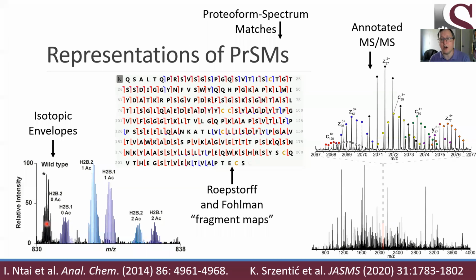Remember that any carbon that you see in a protein is generally carbon-12, but about 1% of the time, a carbon is instead a C13, or a 13C, a carbon nucleus that has one additional neutron to it. As a result, when you have a very large proteoform, you're going to see many isotopic variants, in some cases 5, 6, or 10 extra neutrons that are riding around in this nucleus. As a result, the signal for one proteoform is separated across multiple isotopes.